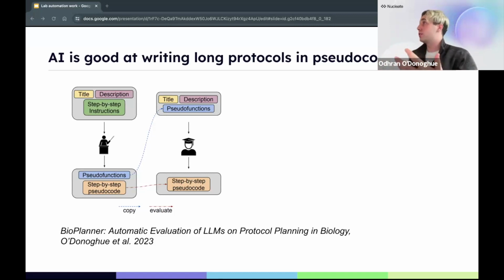You can do all these advanced techniques in AI, things like retrieval augmented generation, where you take information from the past and reuse it to generate things going forward. You can use ways of combining new functions, building new functions, all these fancy things. And you can take all that the models learned about writing functions from reading tons of Python and use this to get models that, in theory, can generate pretty good long-term plans for experiments.